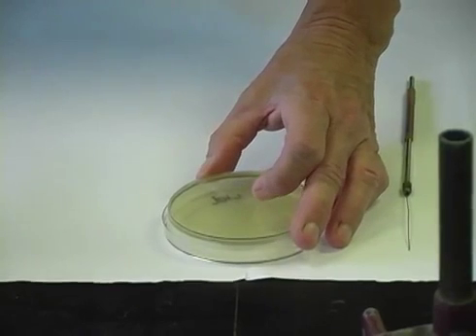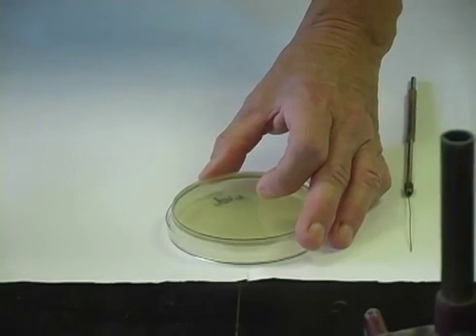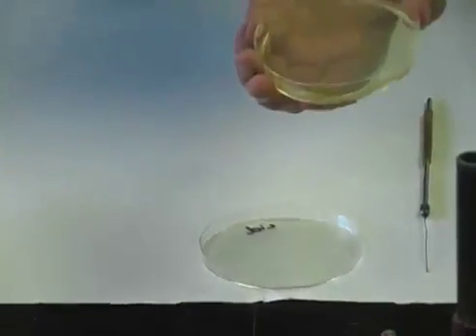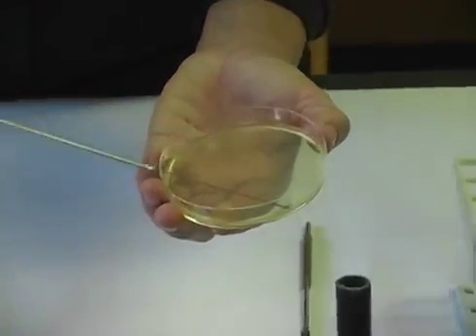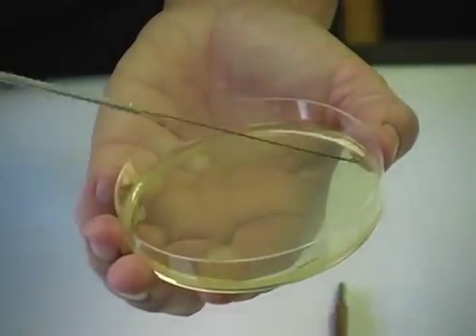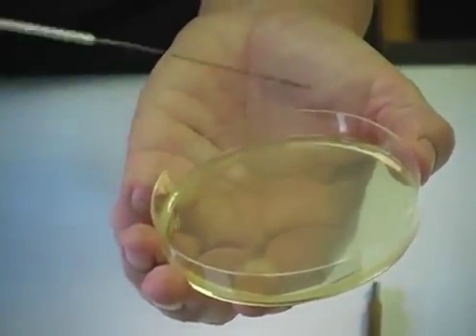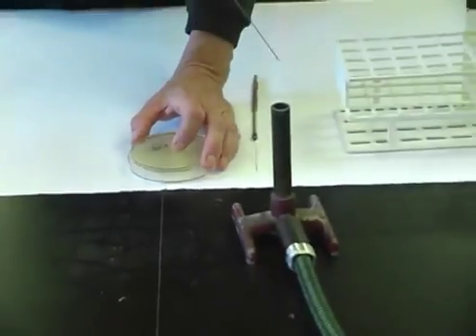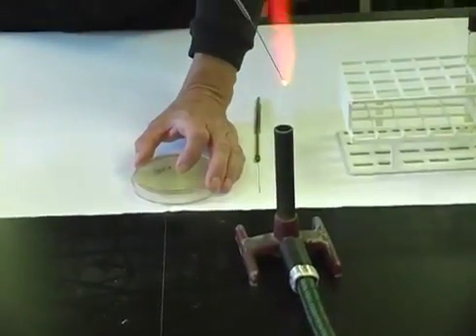The process of spreading the bacteria over the surface of the plate is called streaking. I'll first spread my loop full of bacteria over approximately a quarter of the plate. I close my plate, and I flame my loop to kill any remaining microbes on it.